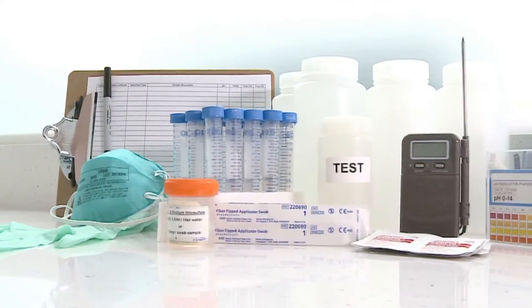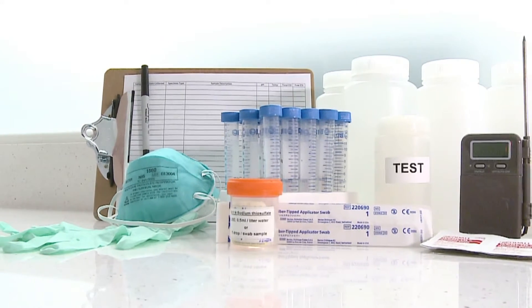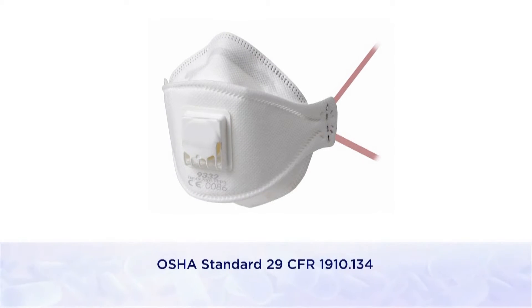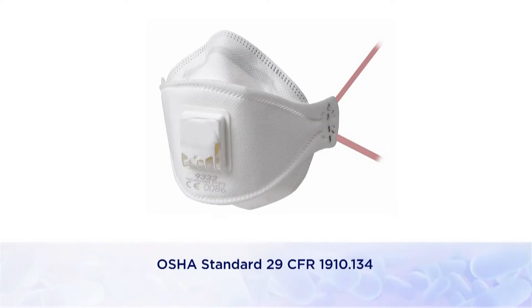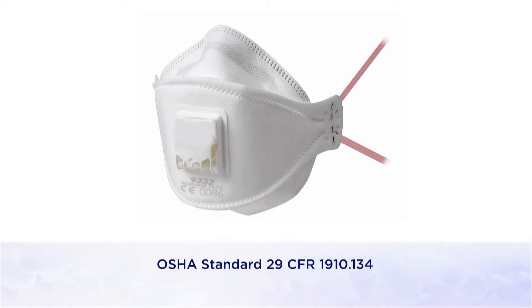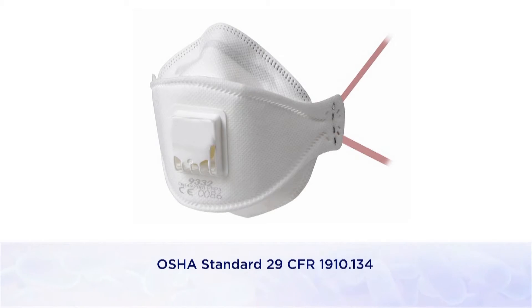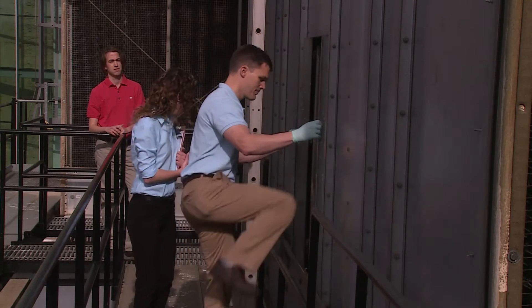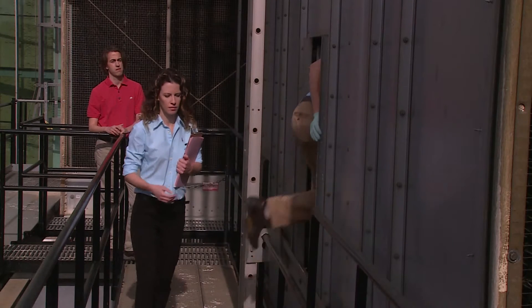When fans cannot be turned off, wearing a half-face air purifying respirator equipped with an N95 filter may be appropriate. Respirators must be used in accordance with a comprehensive respiratory protection program, which includes fit testing, training, and medical clearance ahead of their use. You may also want to wear gloves for protection from the chemicals used to maintain the cooling tower.